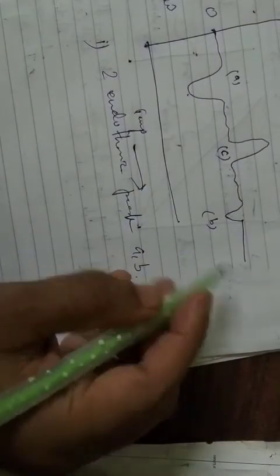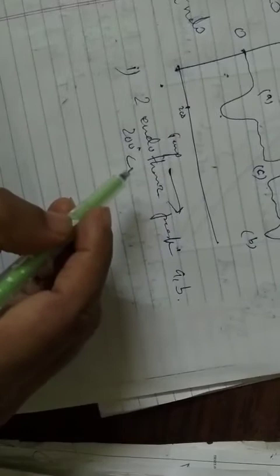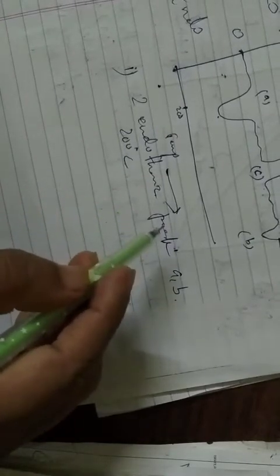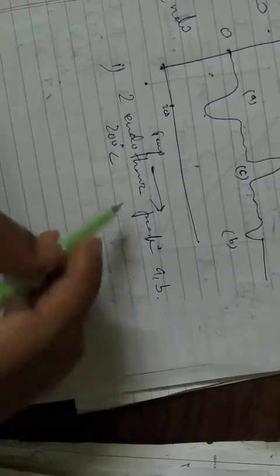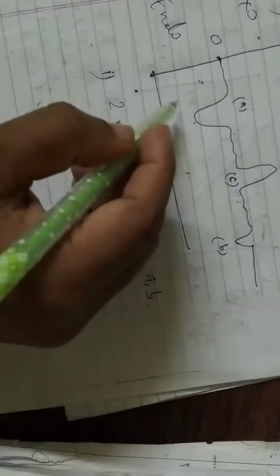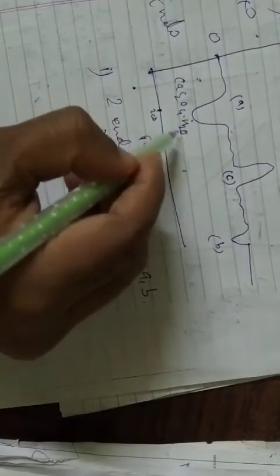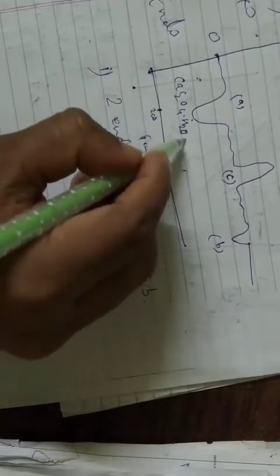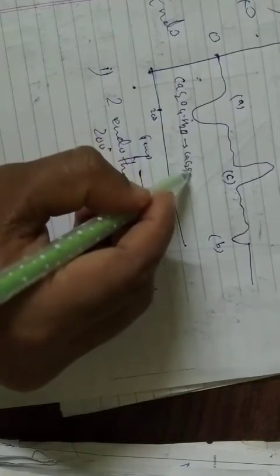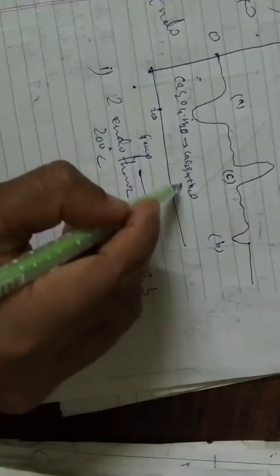Now A: after heating at around 200 degrees centigrade, calcium oxalate monohydrate changes to calcium oxalate, and water gets evaporated, because it is above 100 degrees centigrade. So calcium oxalate monohydrate changes to CaC2O4 plus H2O, which is evaporated.